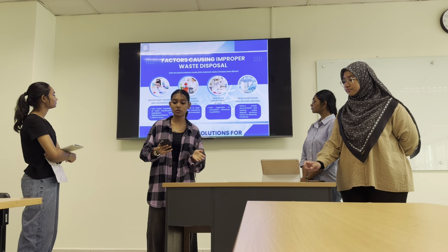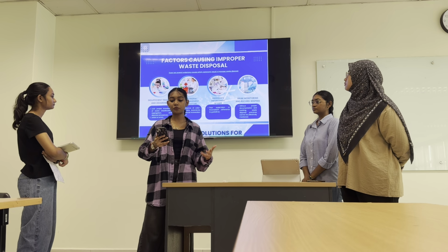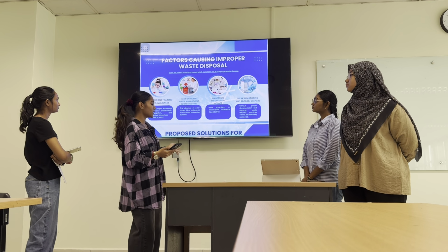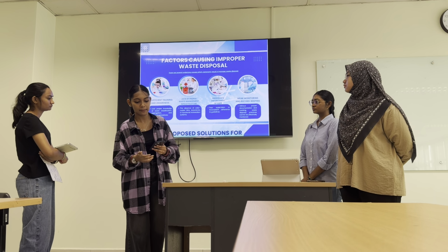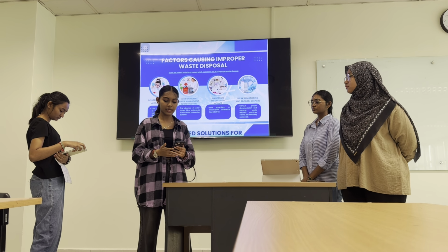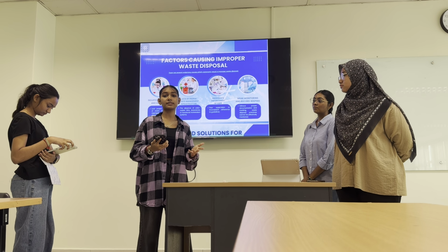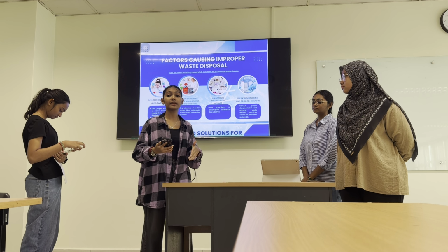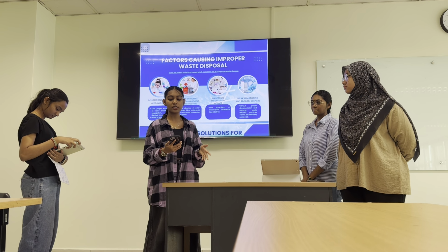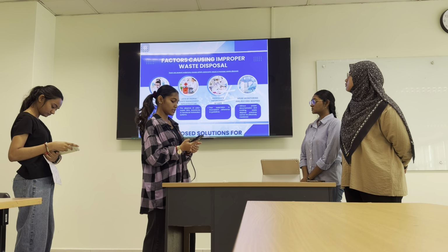which will cause a broader threat to public health and also national security. Okay, now next we move on to the factors contributing to improper waste disposal. Firstly is insufficient training and awareness. Many laboratory personnel lack knowledge of waste classification and safe disposal procedures. Without adequate knowledge and understanding, errors like this are most likely to occur during handling and disposal. Next is lack of proper management infrastructure.